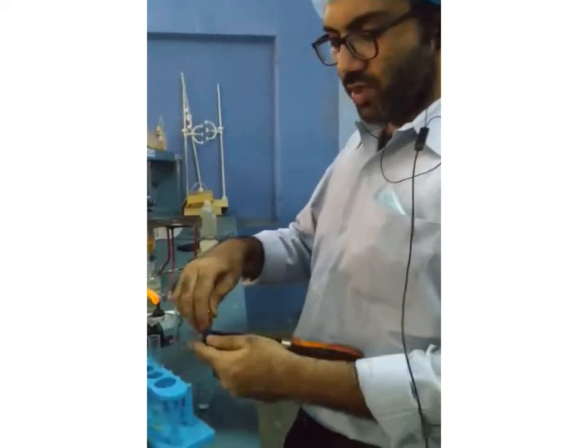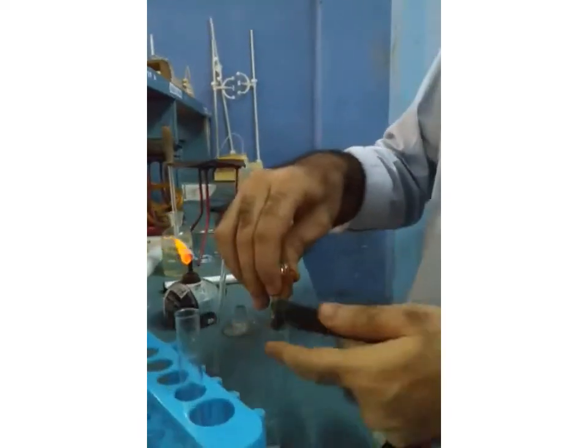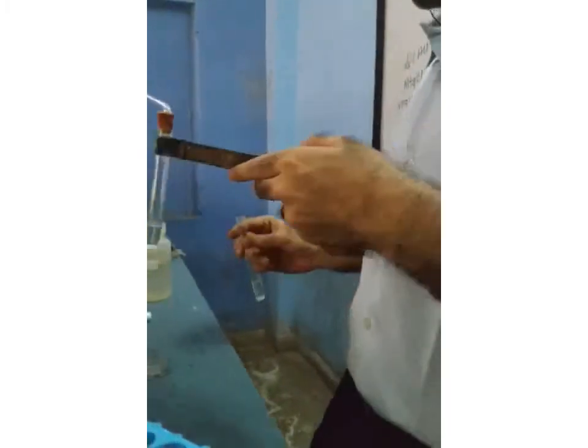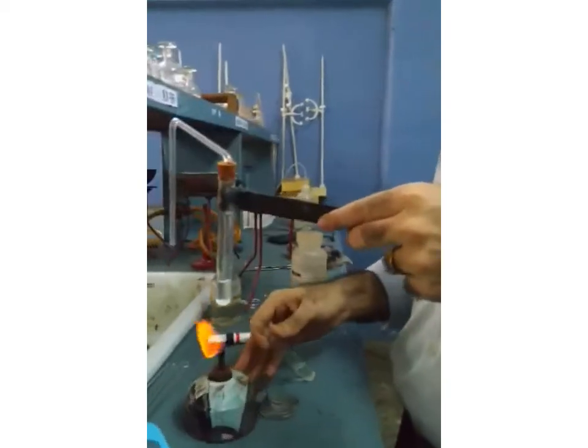So let's do it this way. I'm going to fix this up. This is fixed. The ammonia gas which forms will pass through. Now I'm going to heat this.